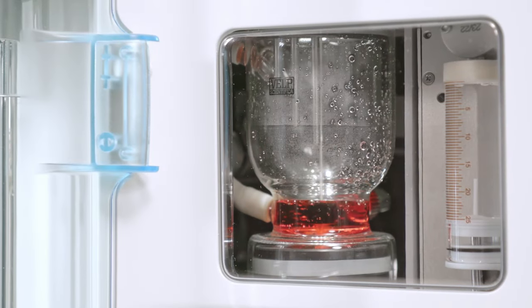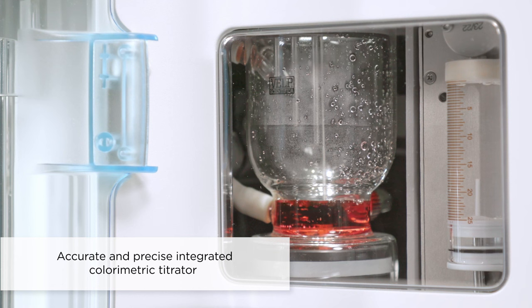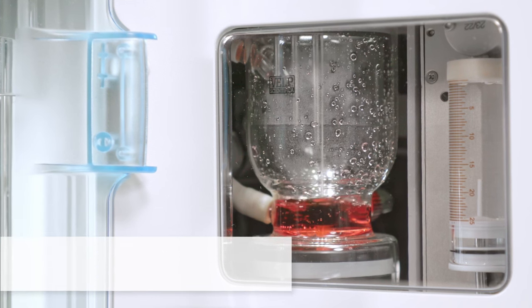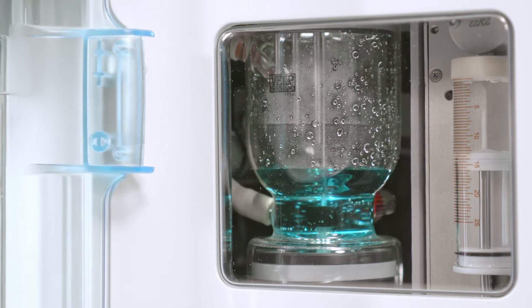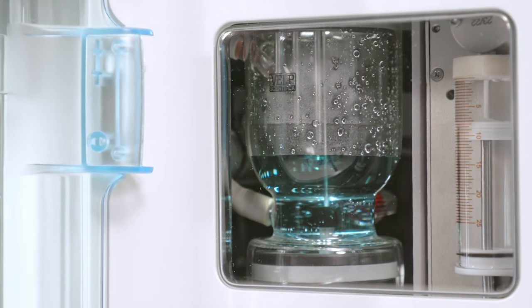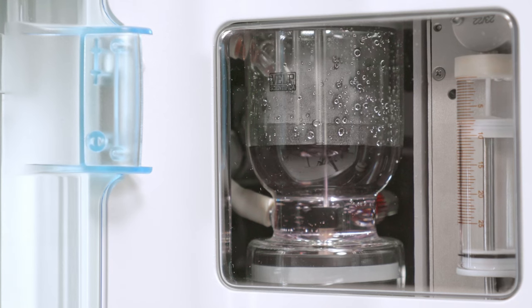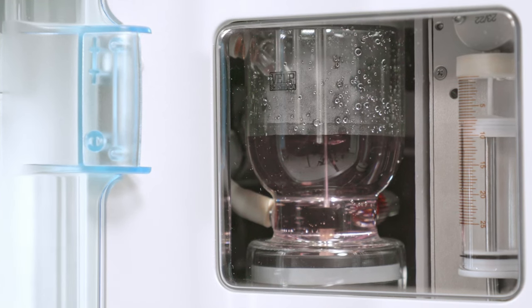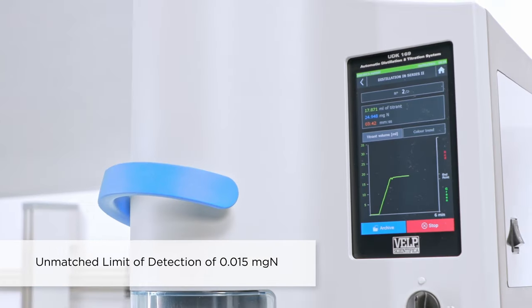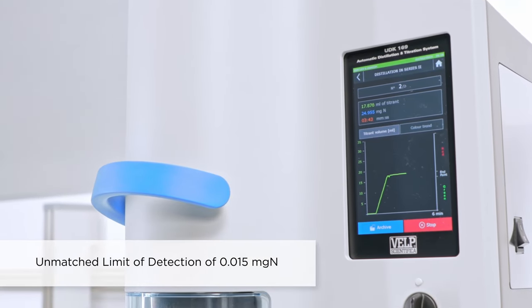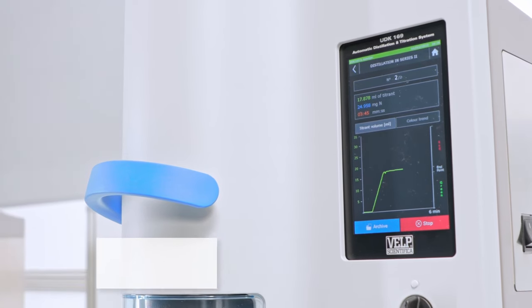The UDK169's integrated colorimetric titrator provides reliable results as it is based on precise chemical reactions of indicators and simplifies users' activities as there is no need for time-consuming maintenance or additional costs for calibration. With a very low limit of detection, the UDK169 is the perfect choice for any sample matrix.